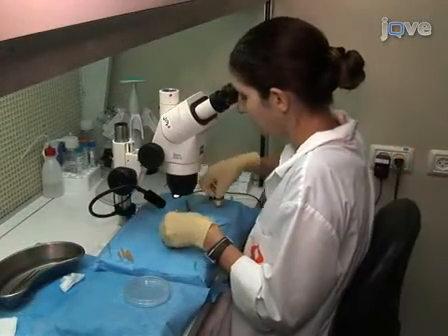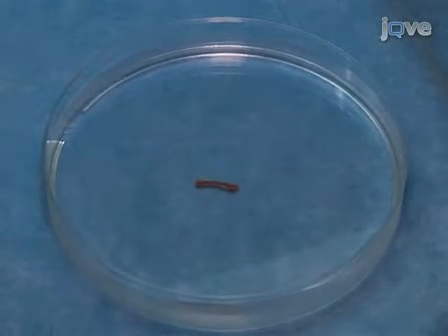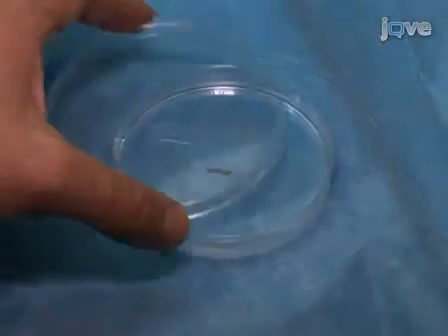Place the excised thoracic aorta in a petri dish filled with cold, sterile PBS. Now that the aorta is removed, the aortic rings can be prepared.